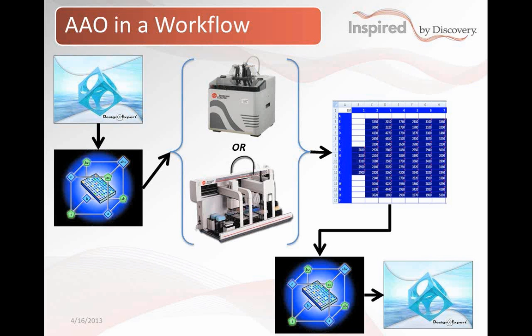You start in your favorite statistics package, create the design that you need, import that into our software, which then makes the method or dispense table that you need. So in the case of the BioRapTR, it's going to be an Excel file in a proper format to be run, and it will either use 4 or 8 bottles depending on your configuration of the device.